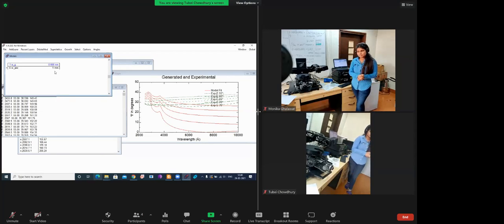It's okay, ma'am. It's okay. Okay, so we'll explain now. It's already 12:46, so we'll explain the other software which is complete EASE. Till now, does anybody have any question? Otherwise, we'll go for the second step. We'll explain the other software.